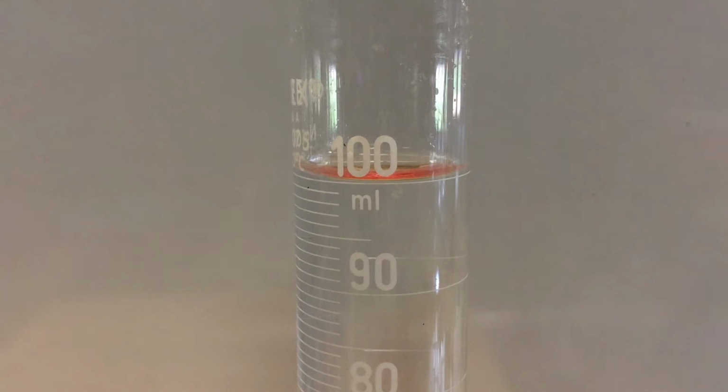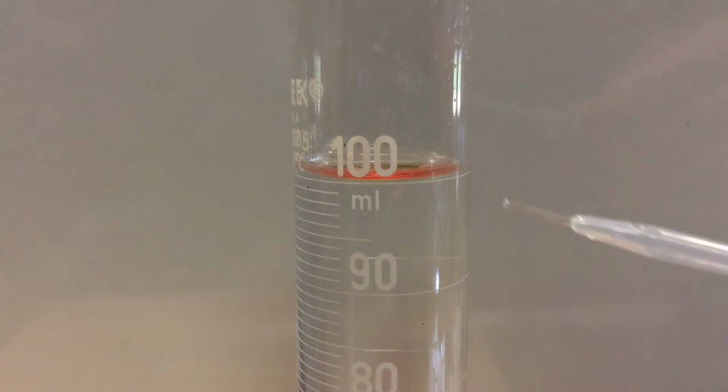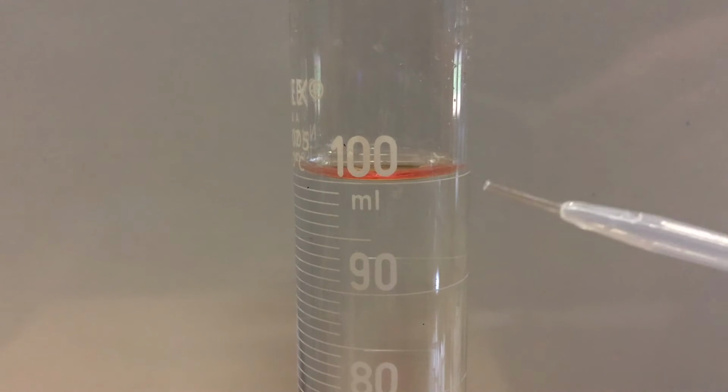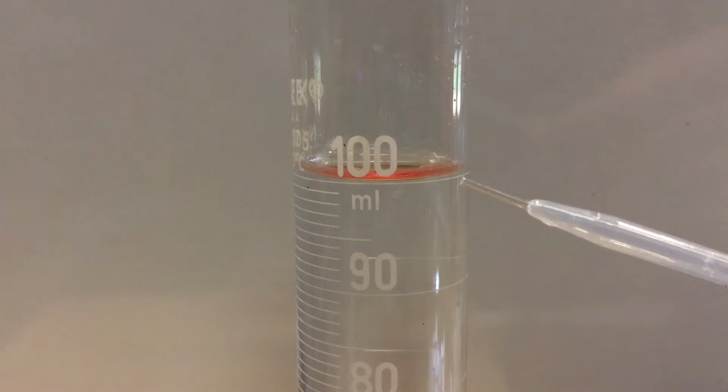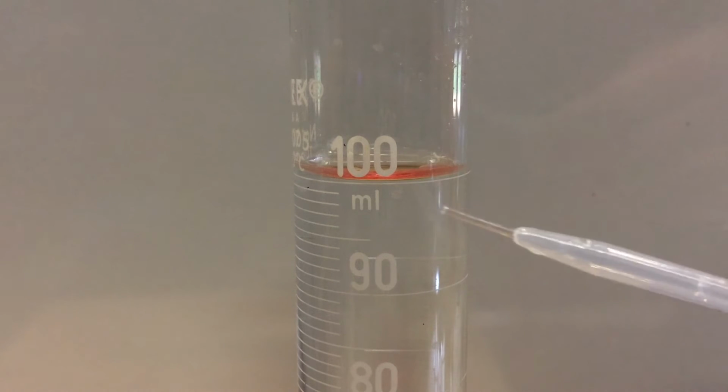And what we're looking to read is the bottom of the meniscus. There's a meniscus when we read a graduated cylinder, and it's a little line that bends because of cohesive and adhesive forces. Cohesive in that the water holds onto itself by H bonds, and the adhesive is that the water is attracted to the silicon dioxide in the glass, so it's kind of holding on the sides.